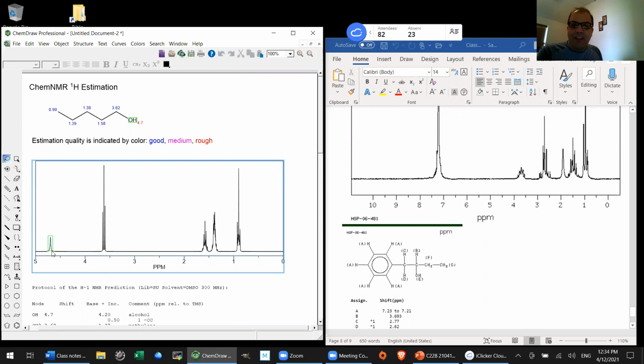They're very confidently, by the way, saying that the OH proton shows up here at exactly 4.7. I think that's kind of cute. And it might, under some circumstances. It turns out in the other alcohol, the OH hydrogen is here. And they often appear rather broad like that, but in either case, I guarantee you, if you used a slightly different concentration in the sample, or it were a particularly hot day that you took the spectrum, that OH peak can move arbitrarily to a different location.